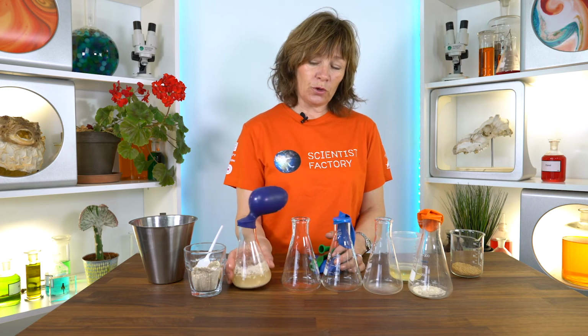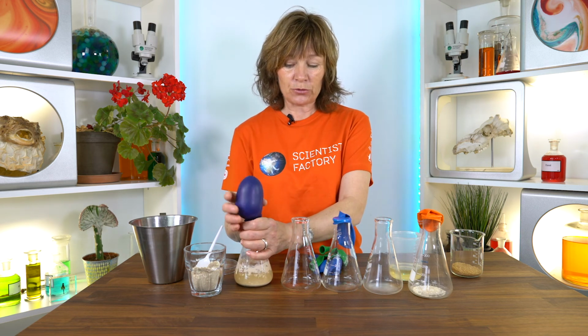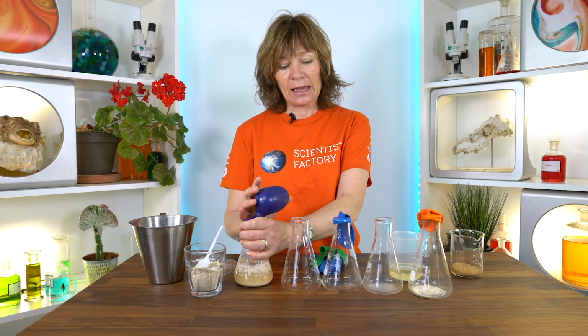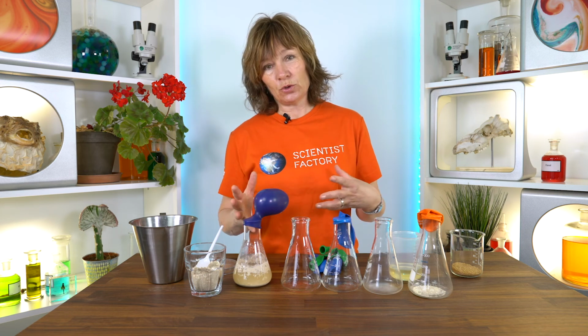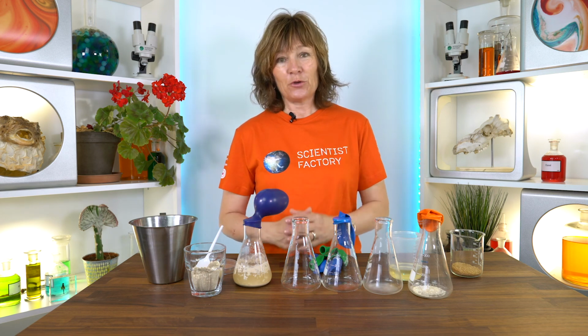And usually after 1 to 2 hours, you can see the result by measuring how much gas has been produced in the different balloons, and then you can conclude. So it's an idea to not start this late in the day, but start it before lunch, so you have time to conclude. Good luck.